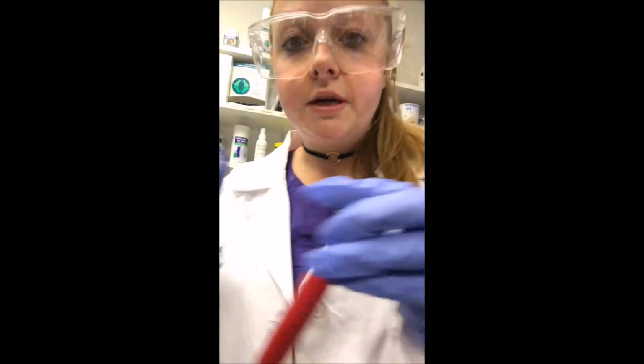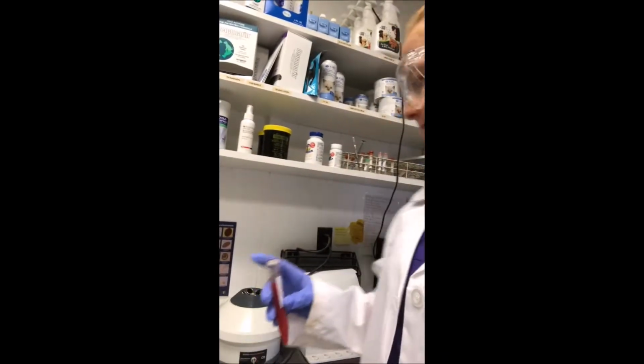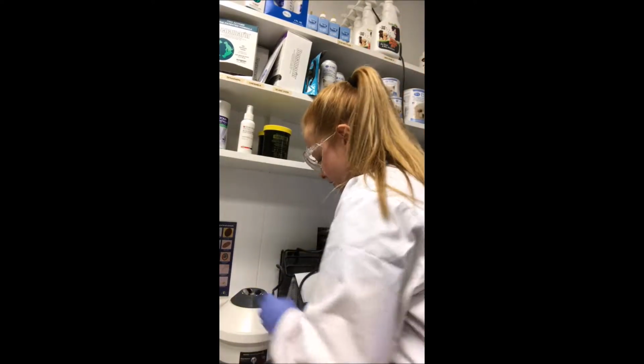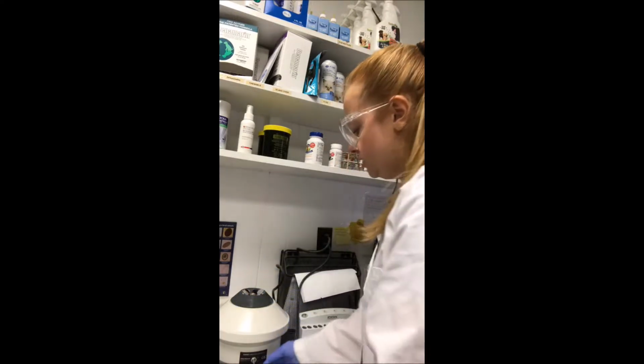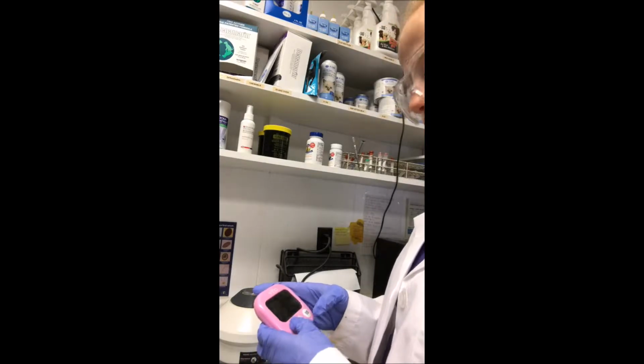Okay, so now we're just going to place it in the centrifuge, and we're going to let it centrifuge for 5 minutes. So I'm going to place this in slot 1. I'm going to place the balance tube in slot 4. And I'm going to turn this on, and we're going to set our timer for 5 minutes.